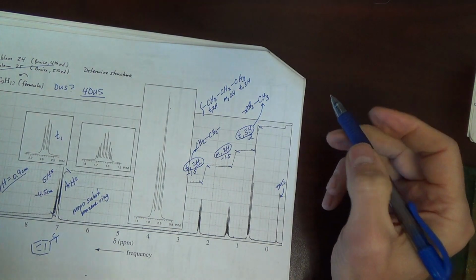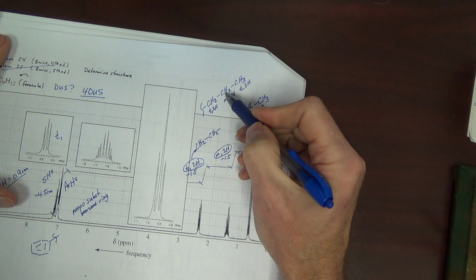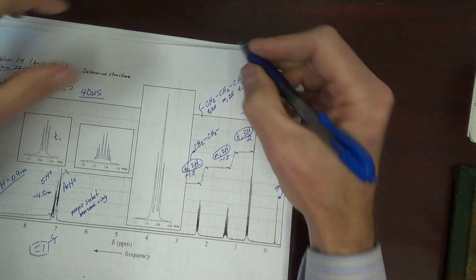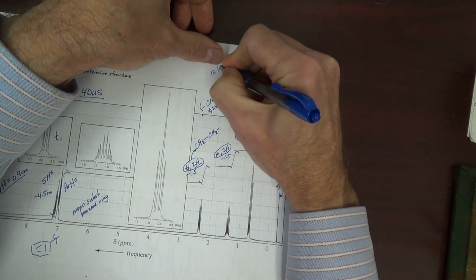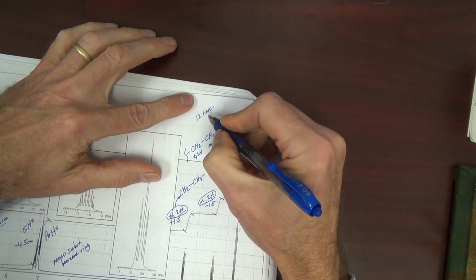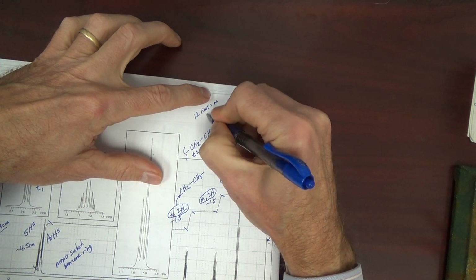because it's complex splitting. This CH2 splits the signal into a triplet. Then that splits each line of the triplet into a quartet, and you end up with 12 lines. Okay? 12 lines. If it's 4 lines, we call it a quartet. More than 4, we're just going to call it a multiplet. All right?